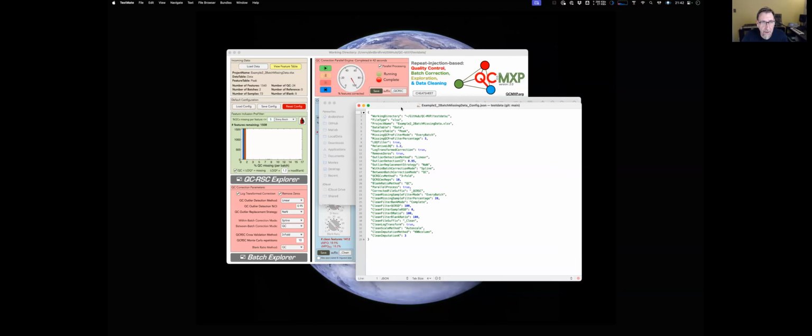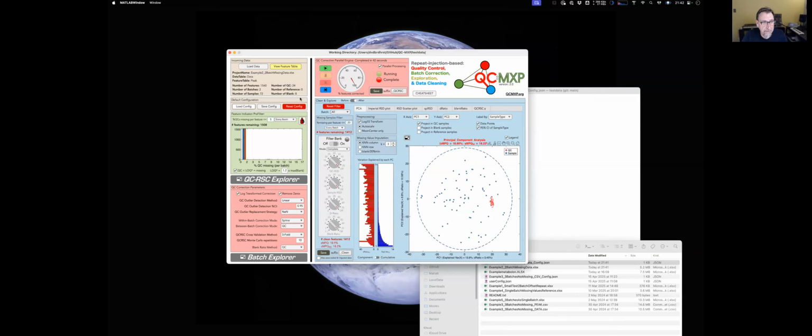It also means that if you wanted to reanalyze it or show the data to somebody else, you can come back to this section of the software and you can load the configuration. And if the configuration has got an associated data file, it will ask you if you want to load in that data as well. So it'll load in all the configuration settings and load in the data so that you can repeat that workflow without having to do anything manually. So that's kind of a neat feature from version 2. But it just means that absolutely everything that you do, right down to the settings for the filters, once you've saved out the clean data, it will replace this file with an updated file with the settings that you've done for all the filter banks. So this is just a good way to then, like I say, keep a record.